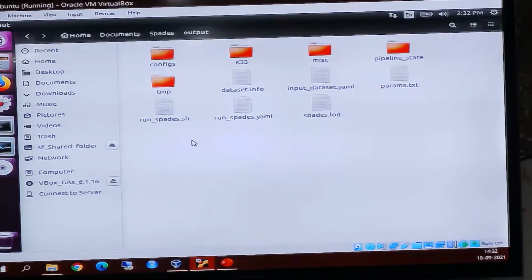Now I can do this. We are having reads that segments. We can create a folder for this. Which bacteria did you sequence? Another reference. Not this software.